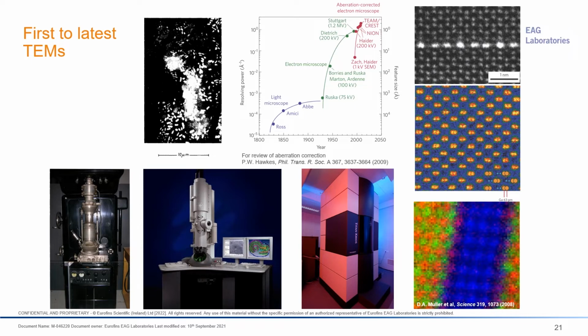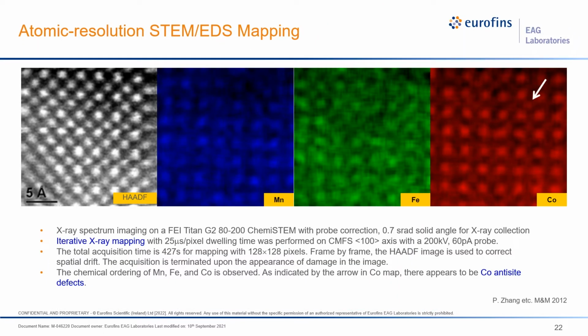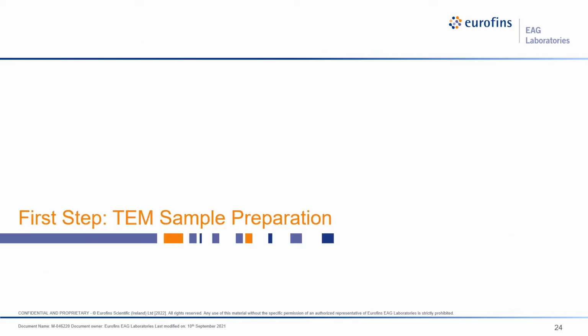But I need to emphasize again and again, that this sample can do such analysis doesn't mean that your specific sample can do that. For such high resolution, you are pumping a lot of electrons onto your sample, and that will actually damage your sample in most cases. And again, atomic resolution EDS is available. This is my data from many years ago already.